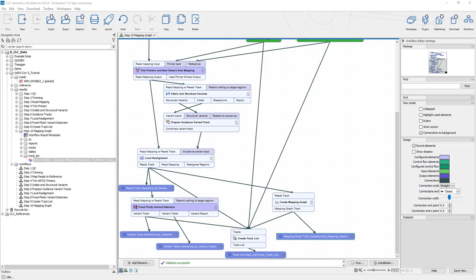How are viral strains moving around? How are viral strains being introduced to different regions? So it's critically important to share it. And in order to share it, you will be sharing raw data to NCBI with the Sequence Read Archive, but you'll also be sharing consensus sequences with hopefully both GISAID and GenBank. So right now I'm going to show you how to get the consensus sequence.